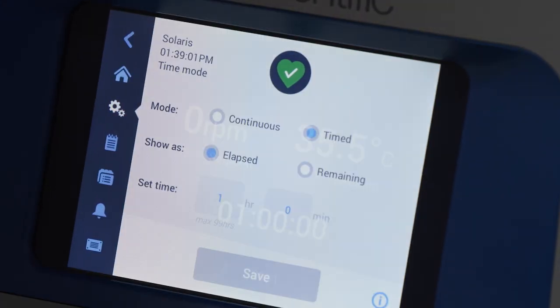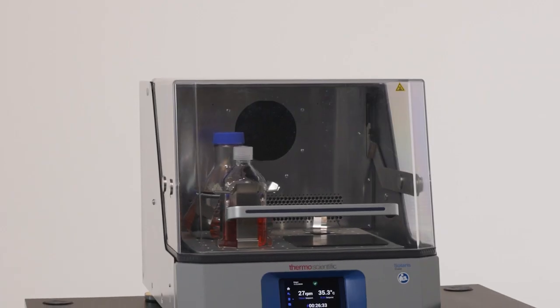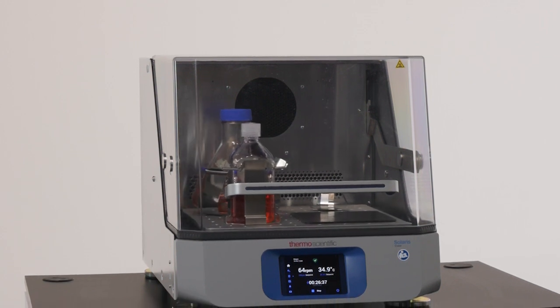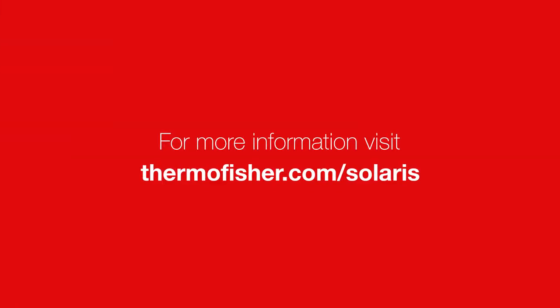With an intuitive touchscreen display, built-in data recording, energy-efficient Peltier refrigeration, quiet operation, and ergonomic lid design, Solaris temperature-controlled benchtop shakers set a new standard for reliability and technical innovation.